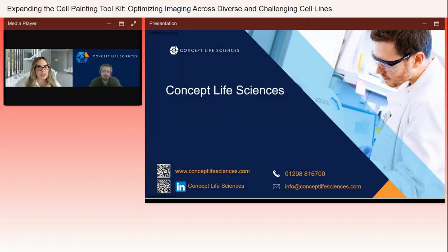All right. It looks like we have time for one more question here. So we'll go ahead and wrap up with this last one. It says, how many compounds and replicates have you tested per experiment and cell line? What pipeline do you use for data analysis? How can you see from the data without needing to look at the images what types of changes are compounds inducing? So that's several questions.